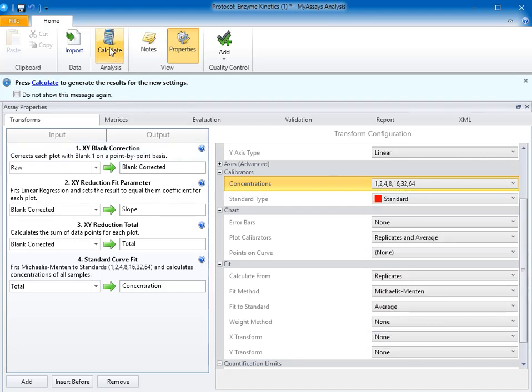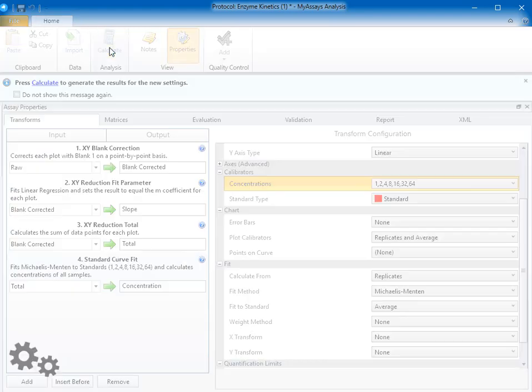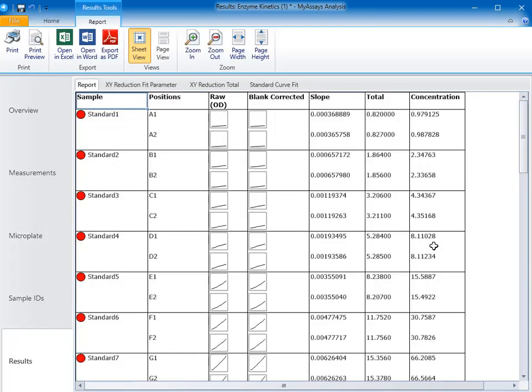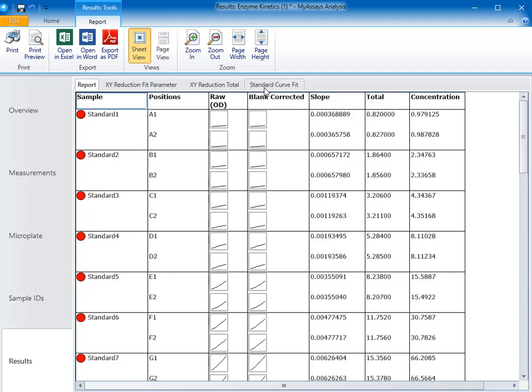Let's calculate our data. On our report, you can see four tabs here at the top of the page: the report tab, the XY reduction fit parameter tab, the XY reduction total tab, and the standard curve fit tab. Starting on our report tab, you can see a sample table that shows the sample IDs, positions, the raw thumb plot, and the blank corrected thumb plot, the calculated slope, the total, and the concentration calculated from the standard curve fit.